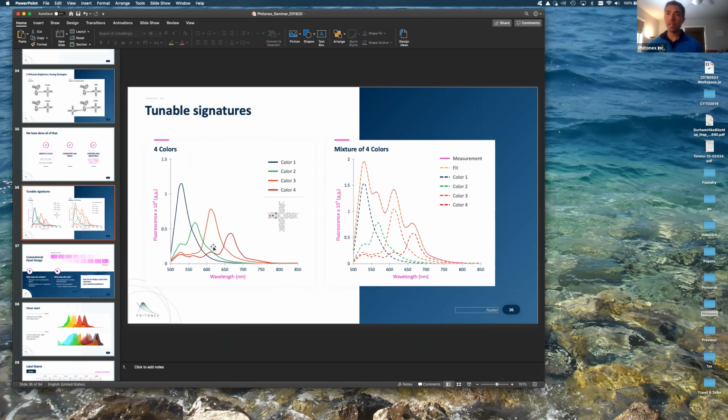you should be able to unmix them. The other point I would make here, which I think is interesting to test and we just haven't tested it yet, is what's the impact of underlying antigen density on detecting these different signatures, and then the ability to deconvolute them. I think that's kind of interesting to consider, right?